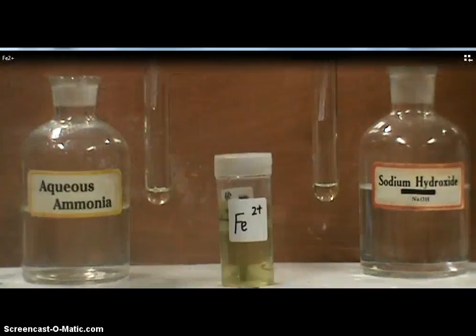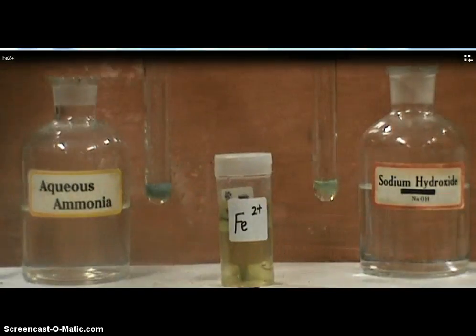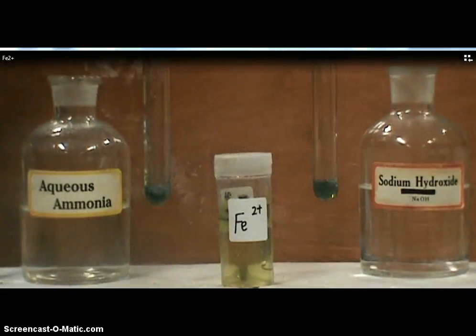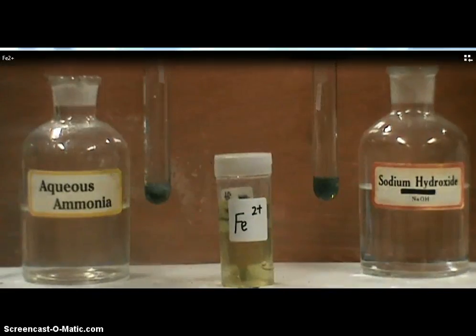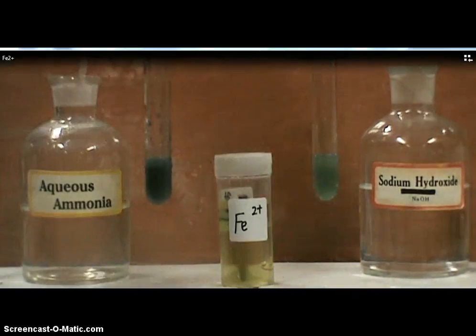Next, we have the iron 2+. When a few drops of alkalines are added to the solution containing iron 2 ions, a dirty green precipitate is formed. The dirty green precipitate is insoluble in excess of both alkalines.